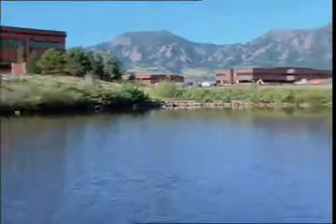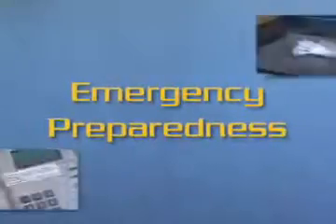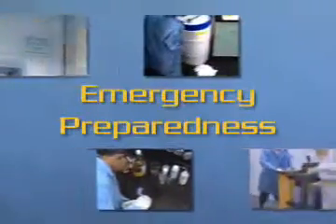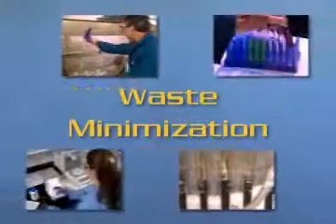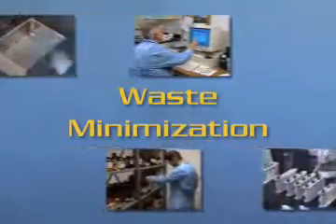To fully realize minimum environmental impact, an organization must confront two special challenges. One is emergency preparedness, constant readiness to respond quickly and effectively to accidents, spills, or leaks that threaten the environment. The other is waste minimization, an ongoing effort to reduce the amount and toxicity of all hazardous waste generated at the lab.